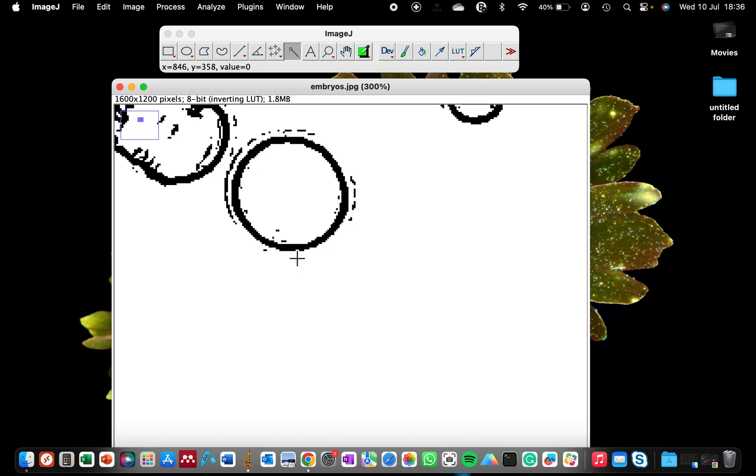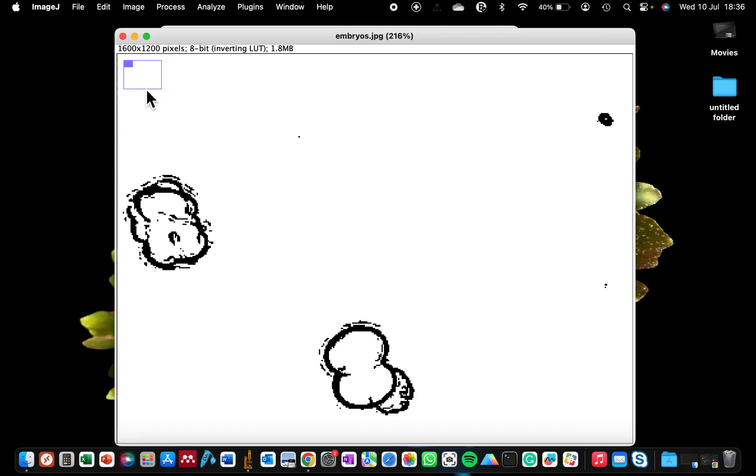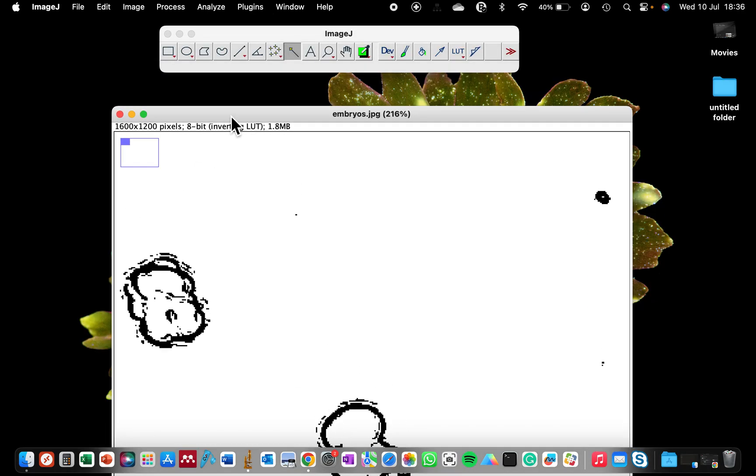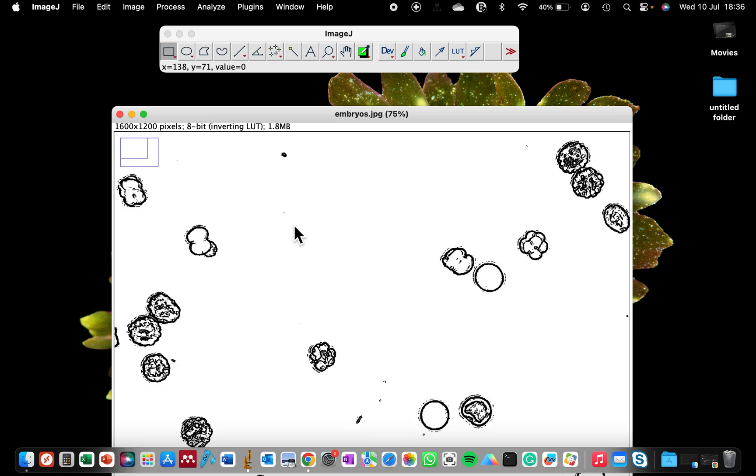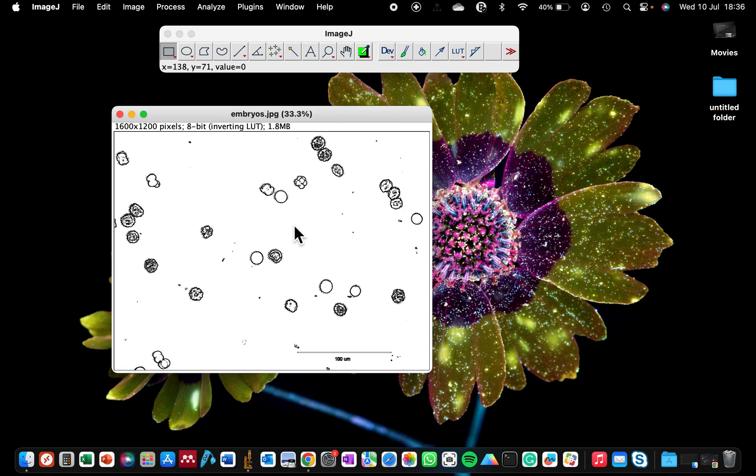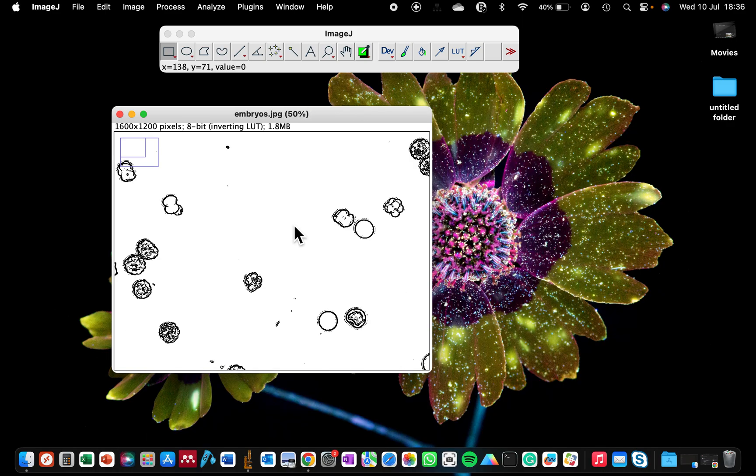If you're interested in quantifying the outside of the cell, just click at the outside of the cell. If you click inside and do your measurements, it's going to be providing you the information with the inside. So you might need to click many times to decide on which area of the cell you want to highlight. Because this tutorial is not about telling you where to quantify, I'm going to show you how to fill the cells that you are interested in.